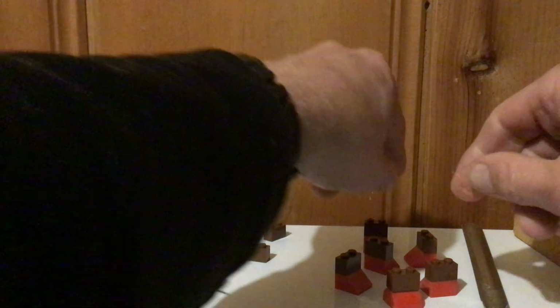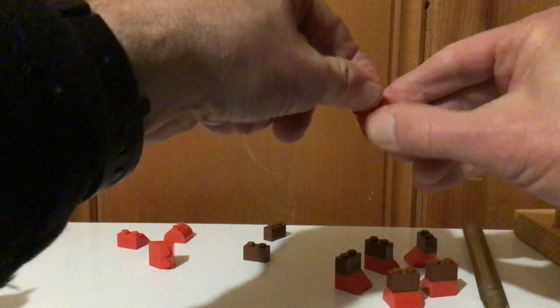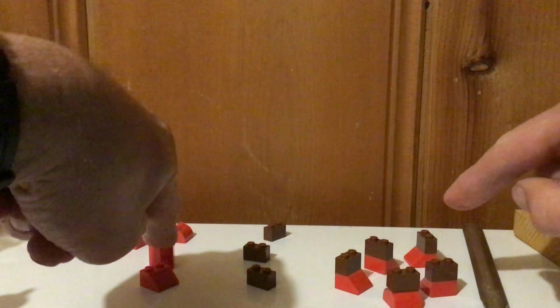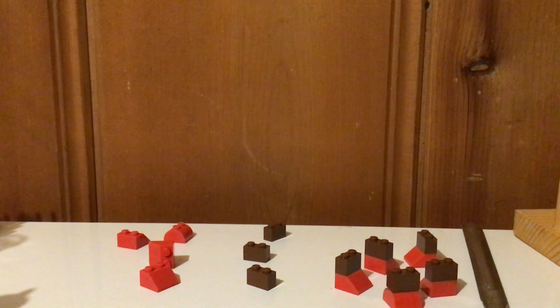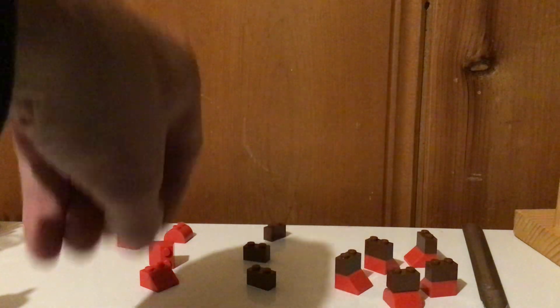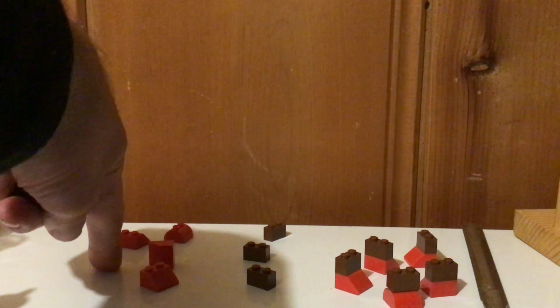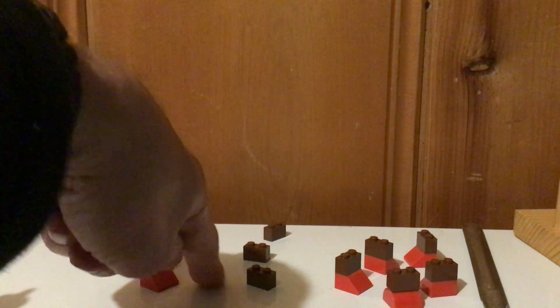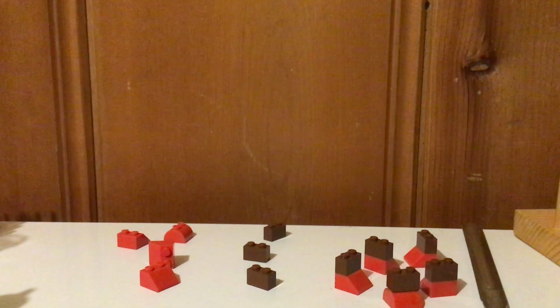But then it's going to start splitting back. Some of these are going to start going back in the other direction. So you're going to go back and forth, and you're going to establish a new equilibrium. Now, what happened was, ultimately, this went up by a lot, but some of it went back down. This definitely decreased, and this one definitely increased.